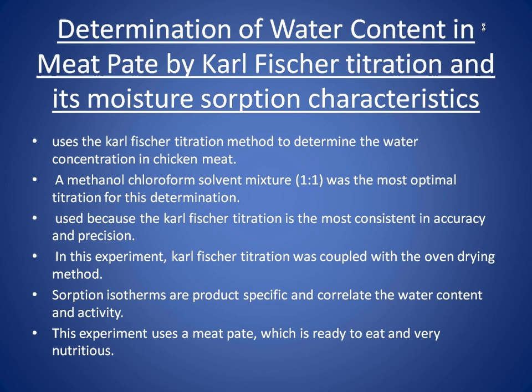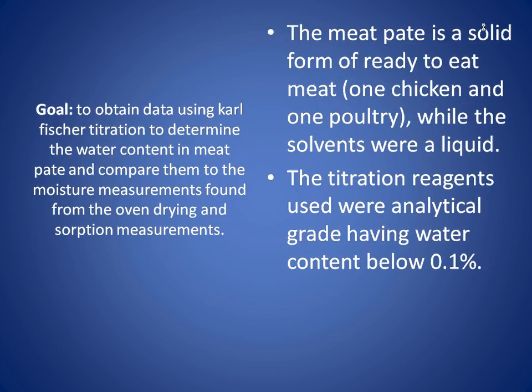Sorption isotherms are product-specific and correlate the water content and activity. This experiment uses a meat pâté which is ready to eat and very nutritious. They are stored at a set temperature, yet despite this, several food poisoning cases have arisen. The meat pâté is a solid form of ready-to-eat meat, while the solvents are liquid.